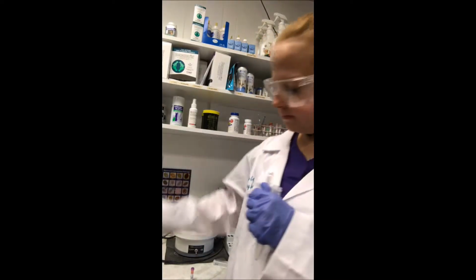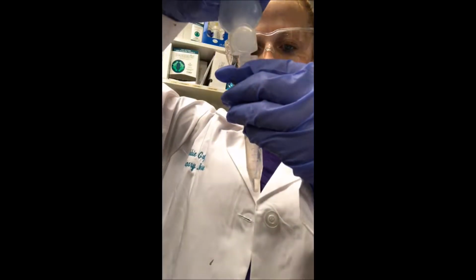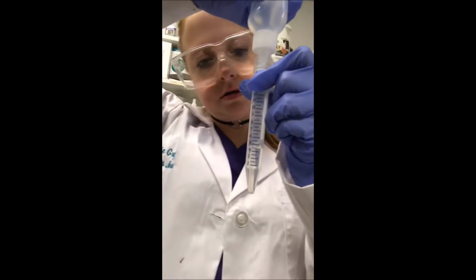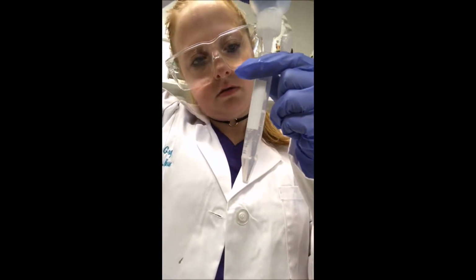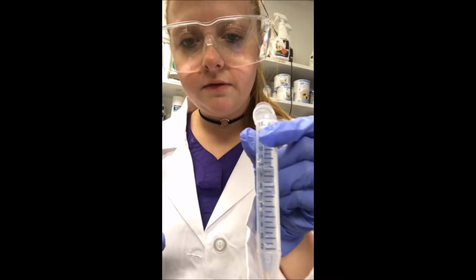formalin. So I've just got my formalin in this bottle, and I'm going to add until we get 10 mLs in there. Okay, 10 mLs of formalin.